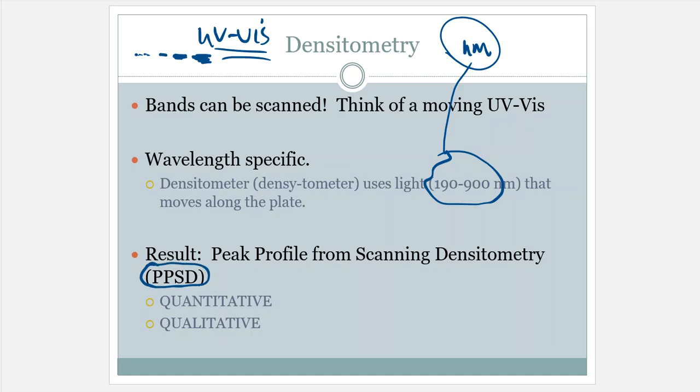Woo! I've got PTSD from this class. Okay, well, PPSD is peak profile scanning densitometry.